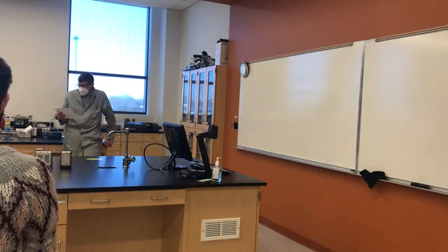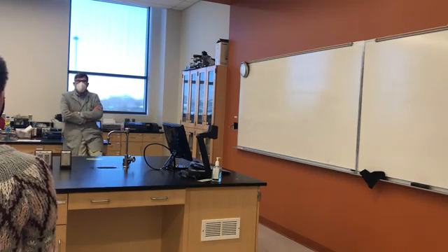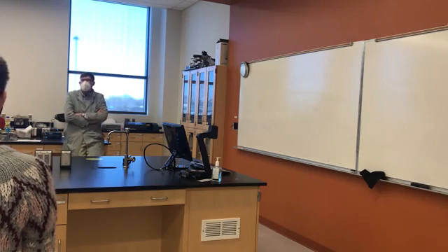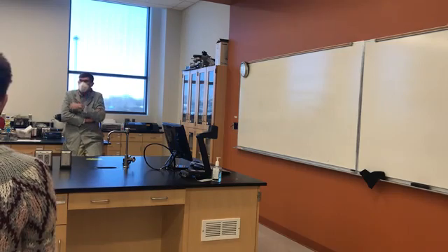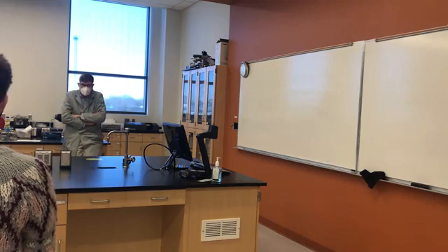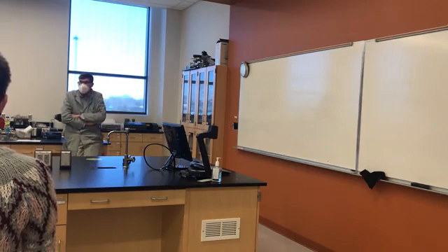The other thing we're going to do is look at the spectra of soy oil and then a partially hydrogenated soy oil. Now, of course, the FDA has banned the use of partially hydrogenated fats here in the United States because of the presence of trans fatty acids, but that's not necessarily the case everywhere in the world. So in some countries, they can still use these partially hydrogenated fats and oils.